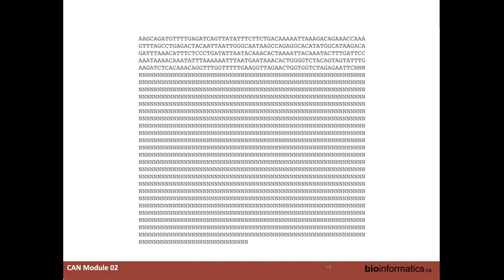And again, towards the end here, what I was telling you, how you have a bunch of N's at the back end of chromosome one. So this hopefully won't freak you out too much. I actually chopped this down. There are pages of rows of N's at the very beginning and very end, because keep in mind that chromosome one is 250 megabases long. So it's a pretty lengthy one.